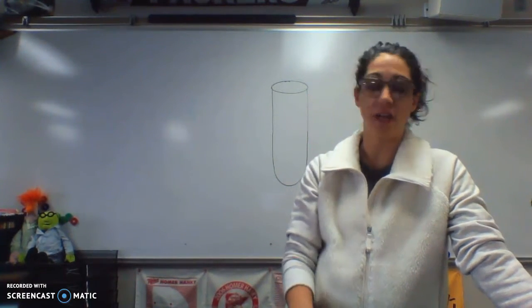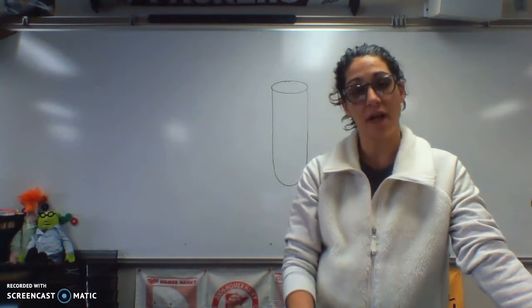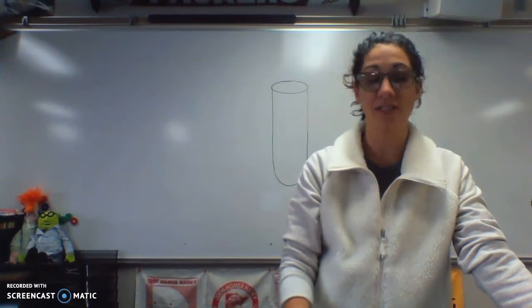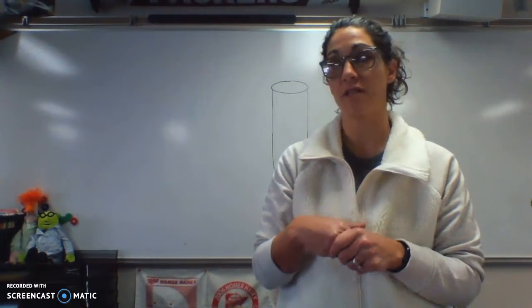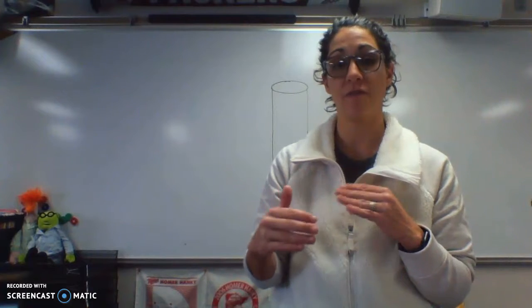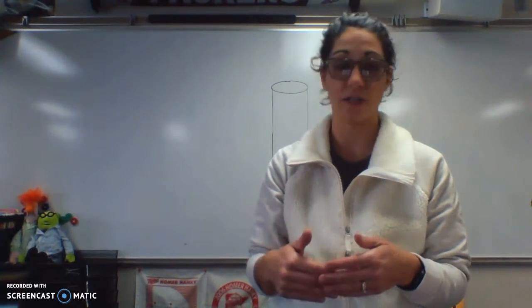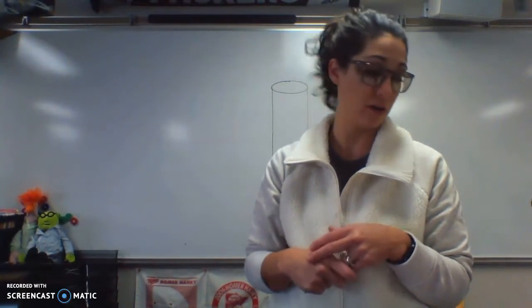So remember, Le Chatelier's principle states that if a stress is applied to a system at equilibrium, the system will shift to relieve the stress. So we're going to add different stressors, and we're going to see which way it shifts based on your observations of what you see after the stress is added. Make sure you're making detailed, good observations for each part.